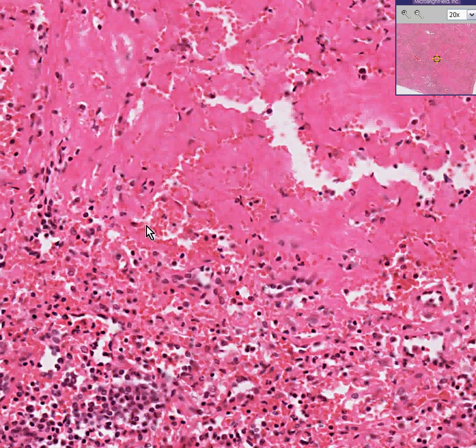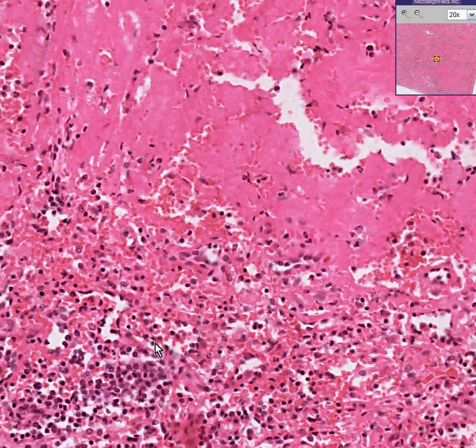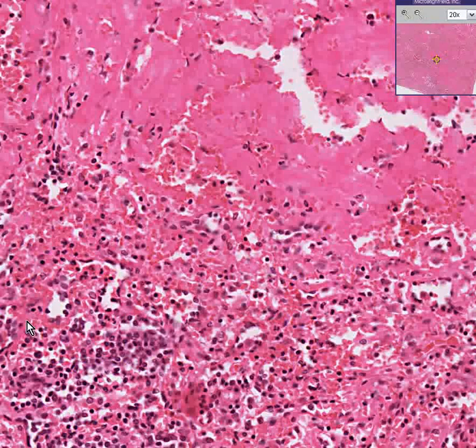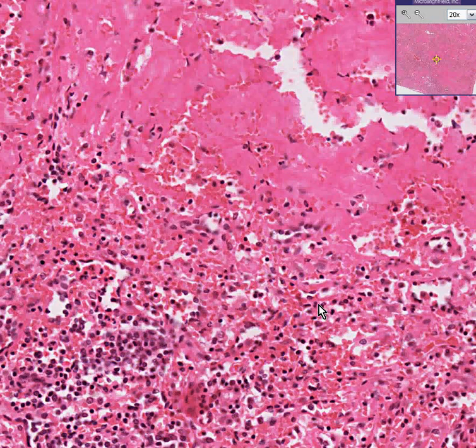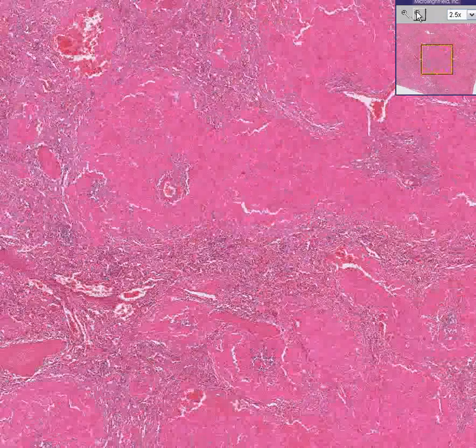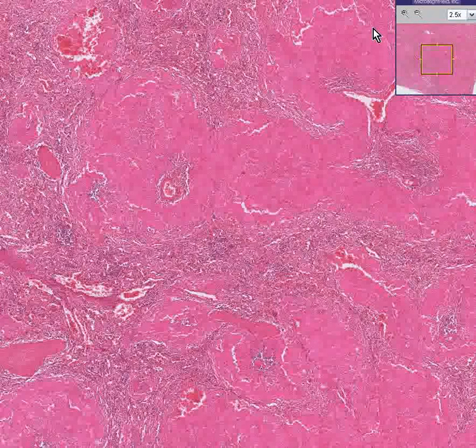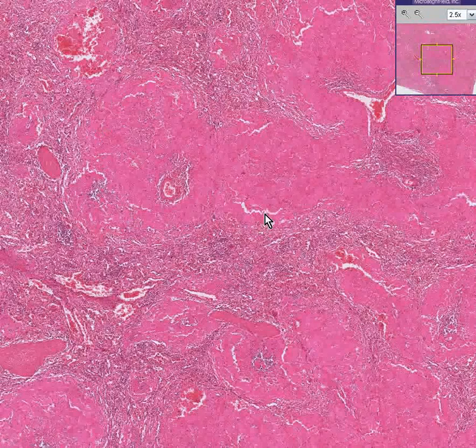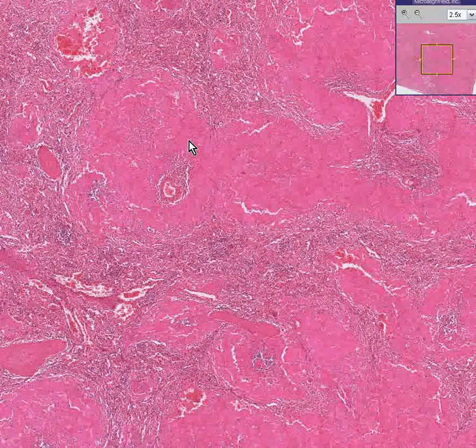And I think when you go up to this power, you could see that there are some areas here that appear lymphoid and some areas in this organ which appear like they are vascular sinusoids. So this is the spleen. But the problem is this spleen is enlarged, and it is chiefly enlarged because most of it consists of these deposits of hyaline material.